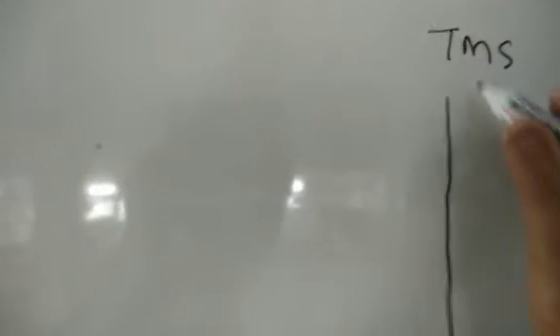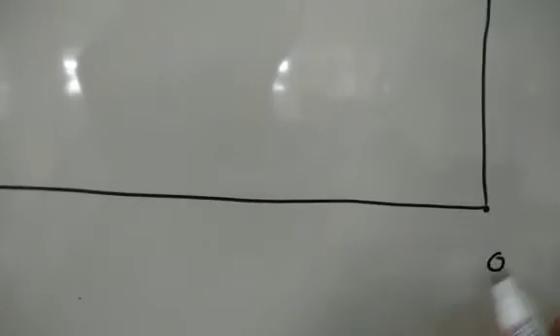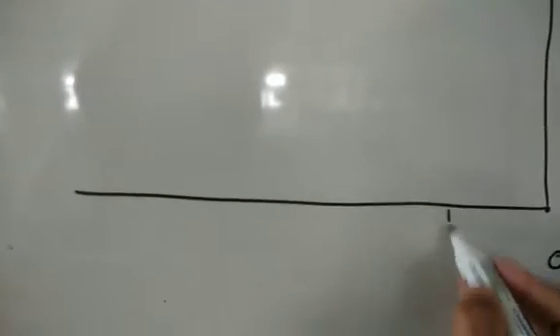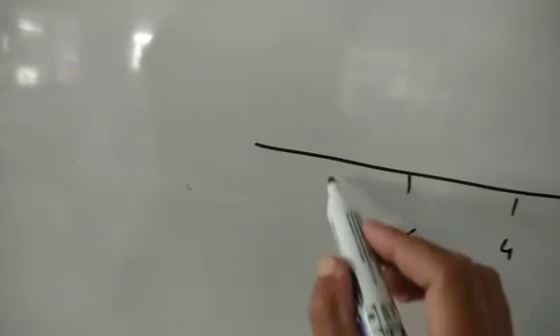फॉर दैट मैंने एक स्पेक्ट्रम को रफली बनाया था यहाँ पे. दिस इज अ टिपिकल NMR स्पेक्ट्रम. दिस इज योर इंटेंसिटी. दिस पीक इज फॉर TMS, which is the standard. For this the delta value is 0, highly shielded. So this is 0. This is the intensity of the peak. This is 2. This is 4. This is your 6. This is 8.